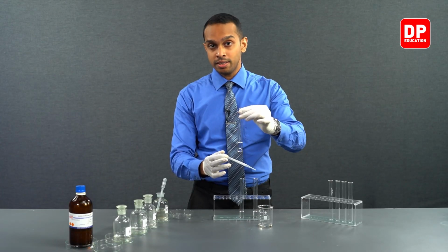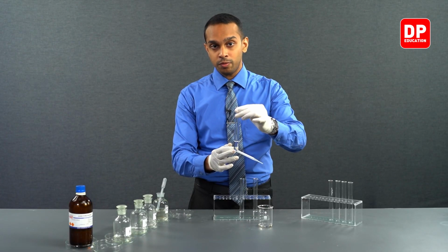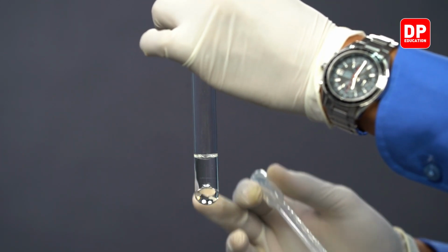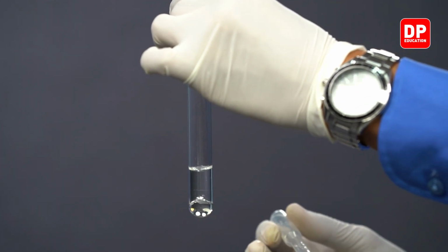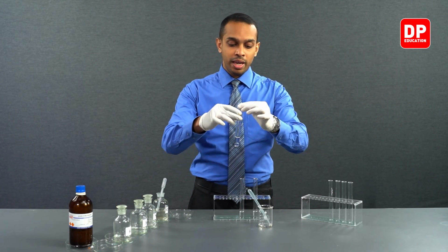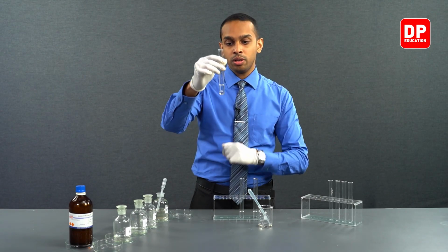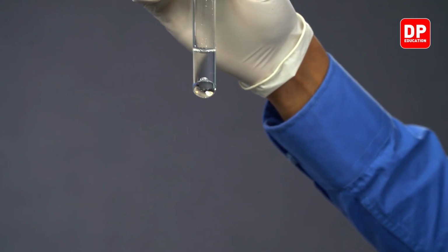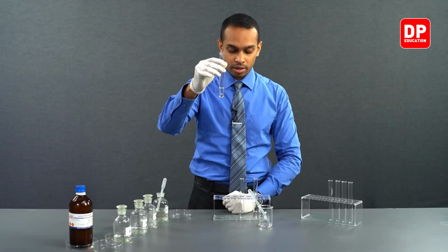This is due to the fact that the organic layer over here, which is non-polar carbon tetrachloride, does not dissolve in the polar aqueous layer. So now we have a small amount of carbon tetrachloride at the bottom and aqueous sodium chloride at the top.